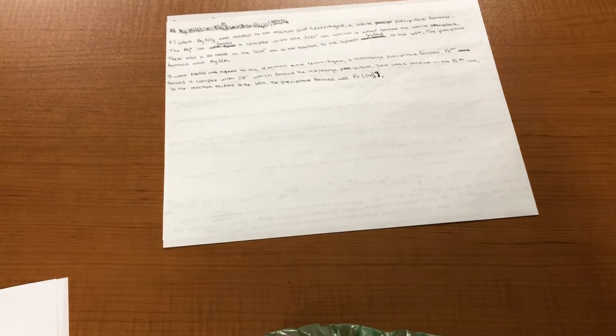When silver nitrate was added to the reaction and centrifuged, a white precipitate formed. The Ag ions, also known as the silver ions, formed a complex with the thiocyanate ions, which is what formed the white precipitate. There was a decrease in the thiocyanate ions in the reaction, so the system shifted to the left. The precipitate formed was silver thiocyanate.